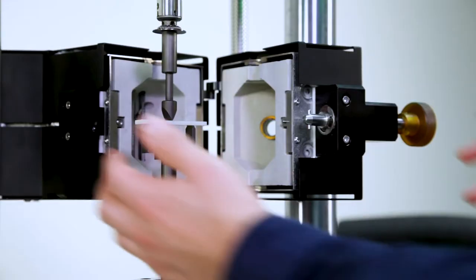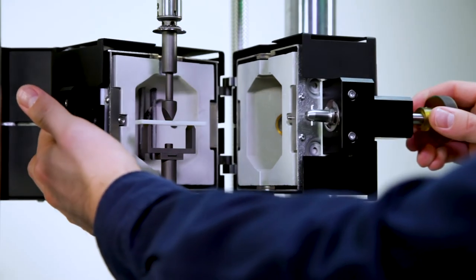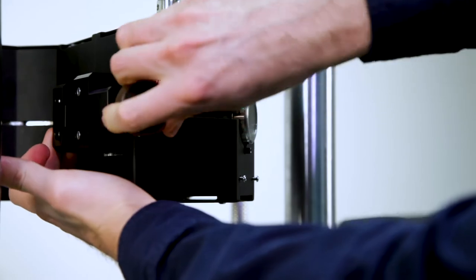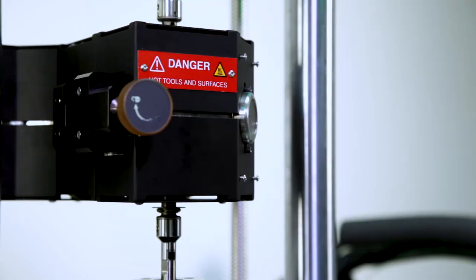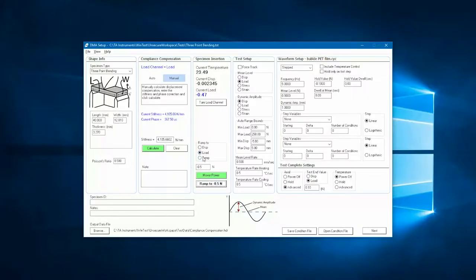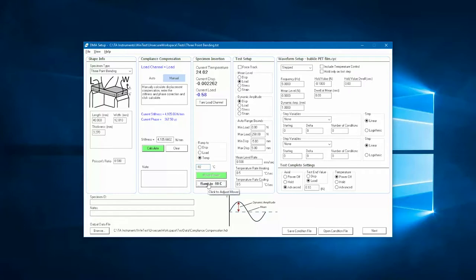If the test requires temperature control, this is a good time to close the chamber door and command the desired temperature. The sample will be allowed to contract or expand due to the temperature change, while the adaptive controller maintains the small contact load.